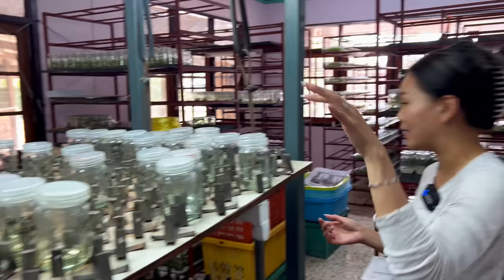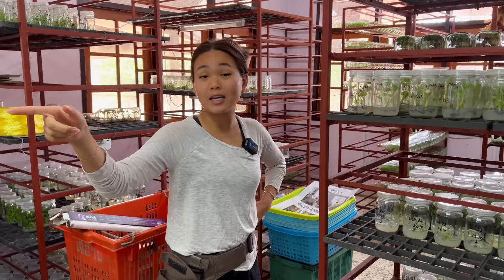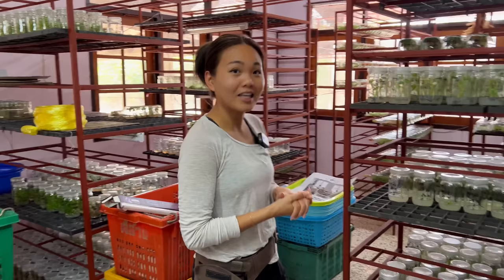So every orchid species or hybrid has different conditions? Oh yeah. Let's say a customer got a new hybrid — they can bring it to me and I might not be able to get it past a certain stage. They can bring it to another lab who might have a different recipe and it might work with them. So just because you have a big lab doesn't mean you can do everything. Everybody has their own techniques.